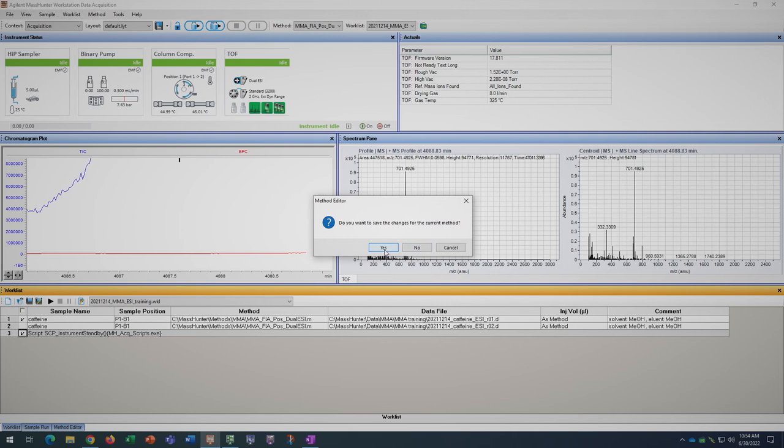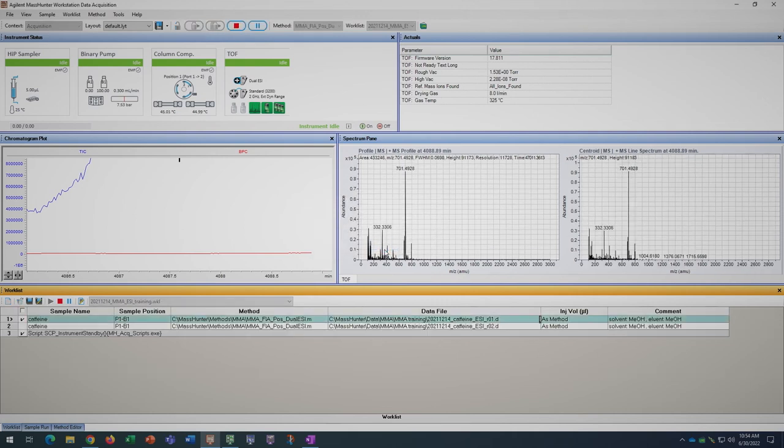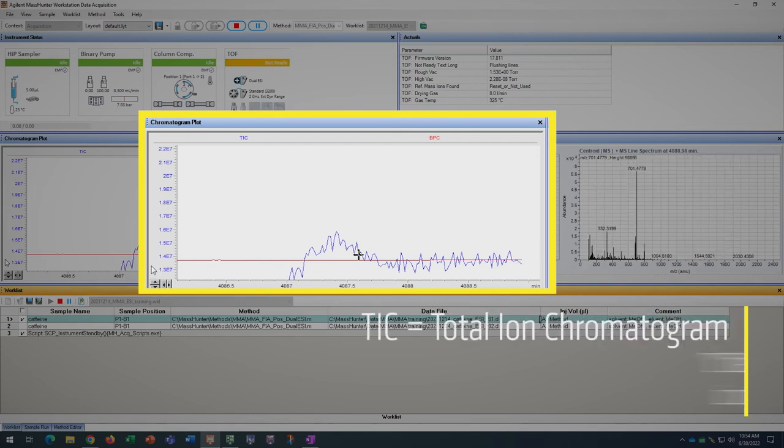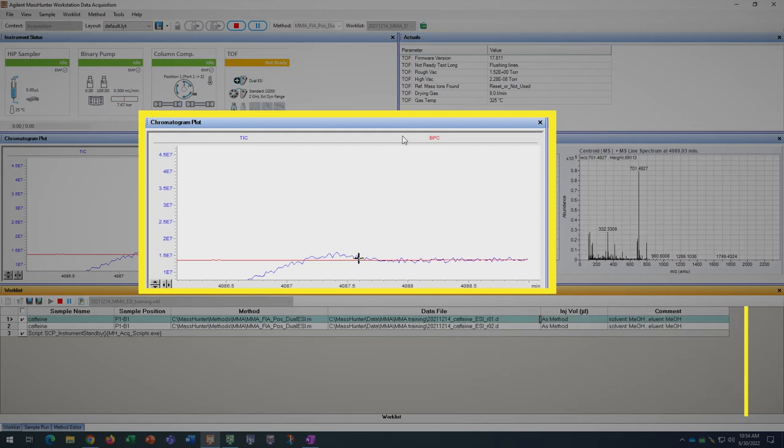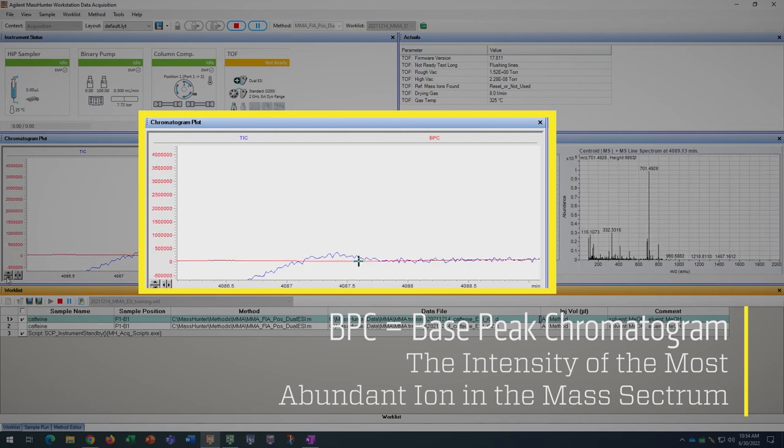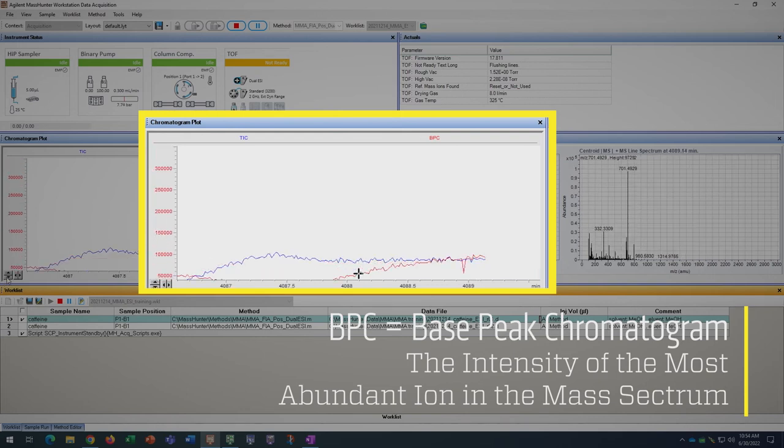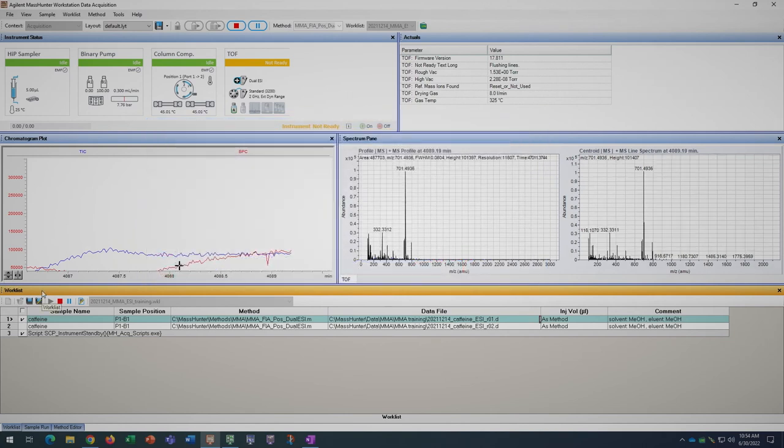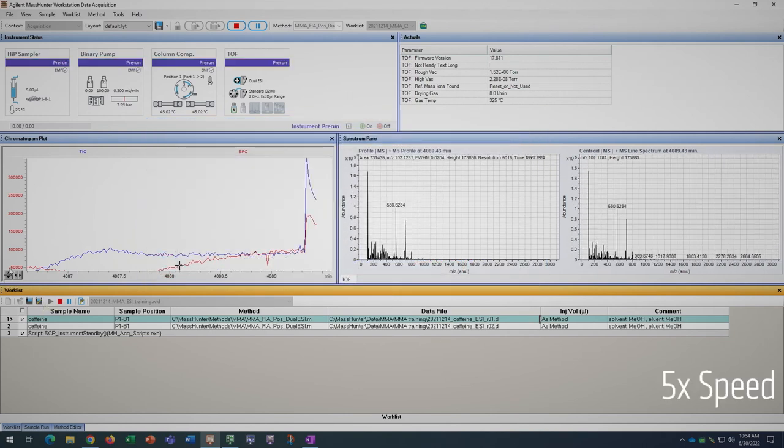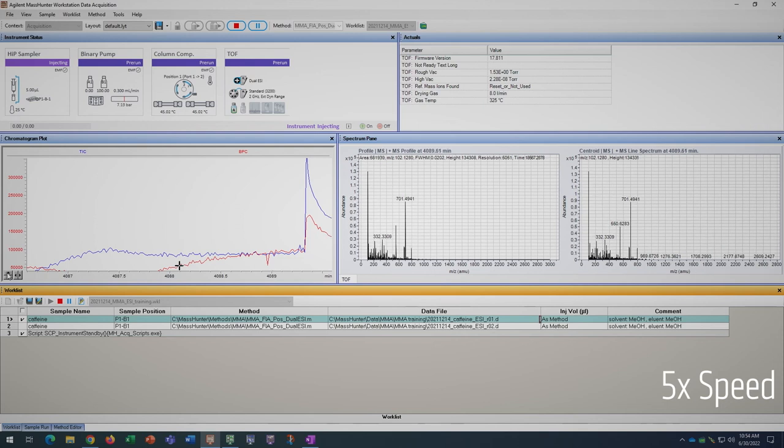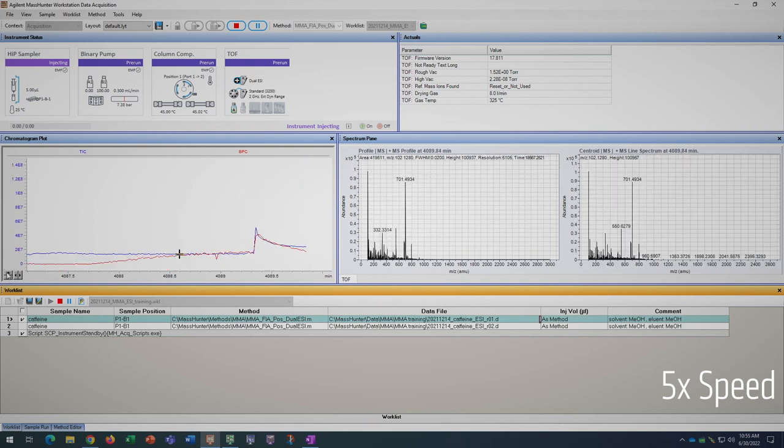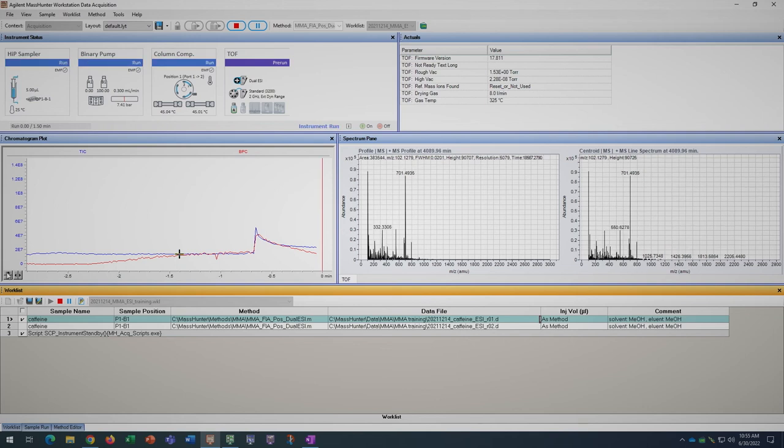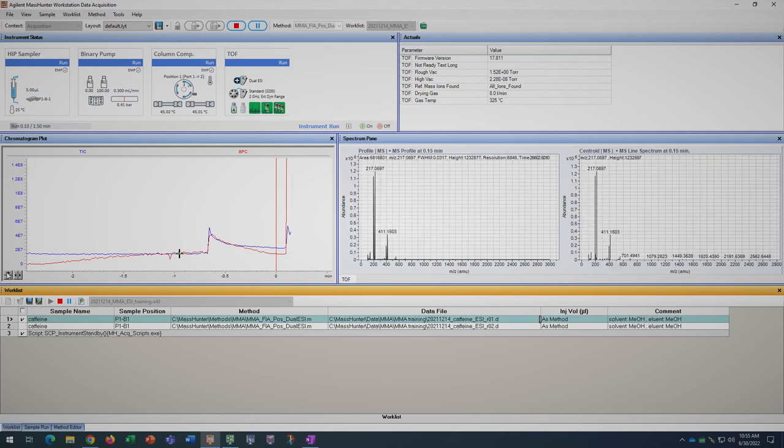As it is running, you can observe the progress by monitoring the TIC and BPC. The TIC is the total ion chromatogram, which is the sum of all of the ions in the mass spectrum. BPC is the base peak chromatogram, which is the intensity of the current most abundant ion in the mass spectrum. If you observe a peak on the TIC or the BPC shortly after your sample run starts, then there is a good chance that your sample has ionized.